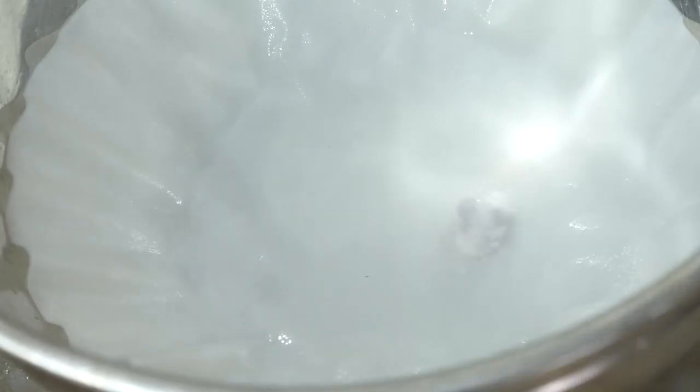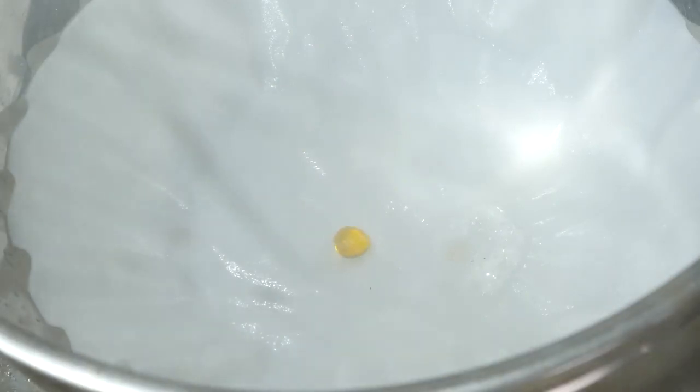And since the sodium hydroxide is so hot, it's actually in its molten state, so you end up with a molten drop of this alkali metal hydroxide. So the reason for the filter paper on top here was just to slow the sodium reaction down with the water, so it doesn't all happen at once. So the ions are able to transport across the filter paper and react with the sodium. So overall, you're left with a molten ball of sodium hydroxide. Whoa, it's completely clear.